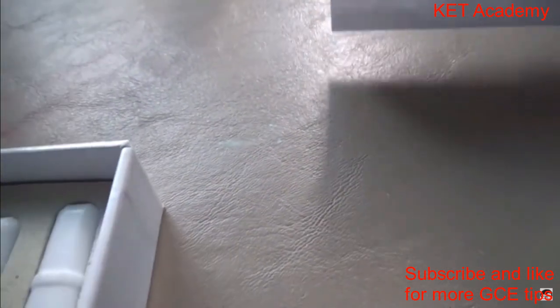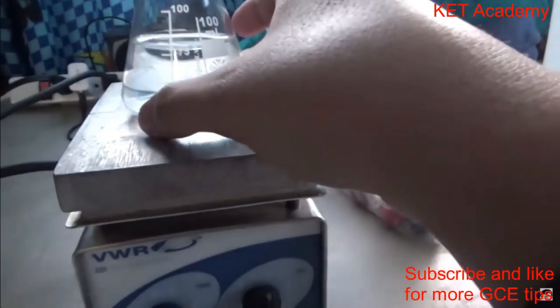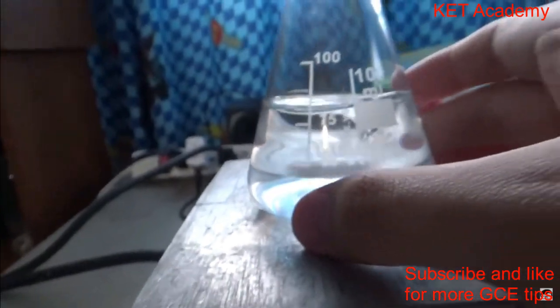So I'm going to add more of these. Quite a bit more of these into here. Just like so, not all of them. Still want a few left. I'll run the stir bar. Got that all dissolved. There it goes. And we will test pH again once that is through.